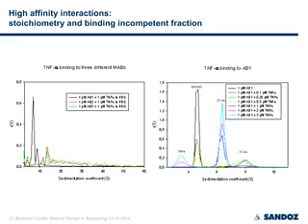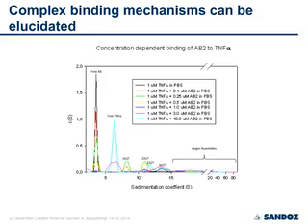Okay, you also may be able to elucidate complex binding mechanisms, although a KD, of course, is difficult to assign for those reactions. You see here for the antibody 2 in the previous slide, this should be free TNF-alpha, this should be free TNF-alpha, and this should be the free antibody, sorry.